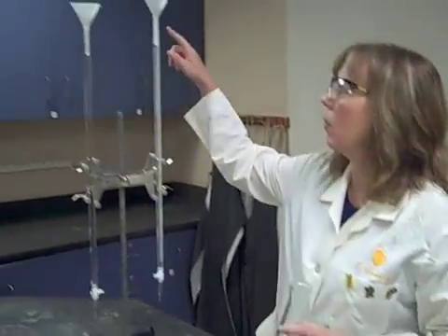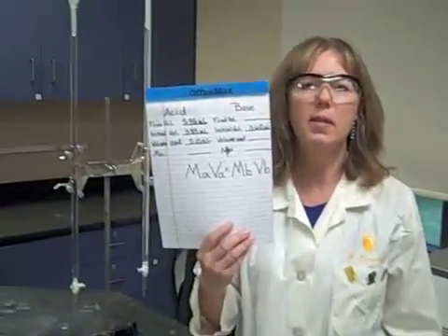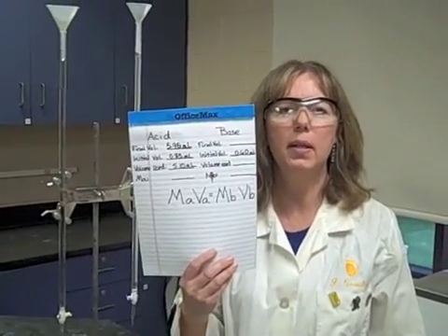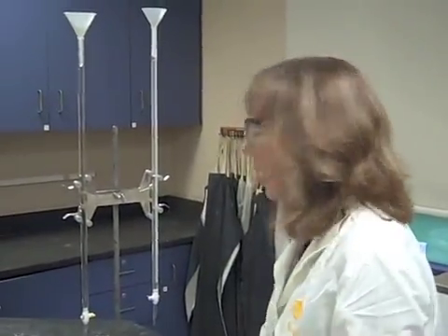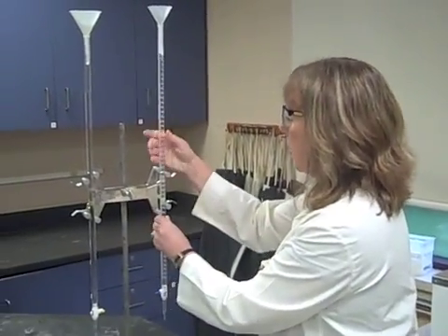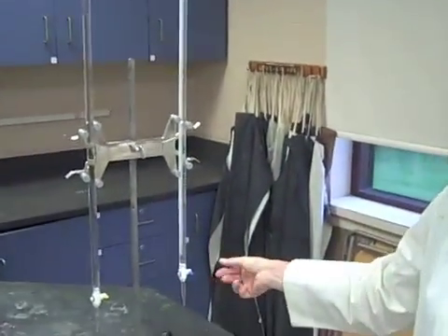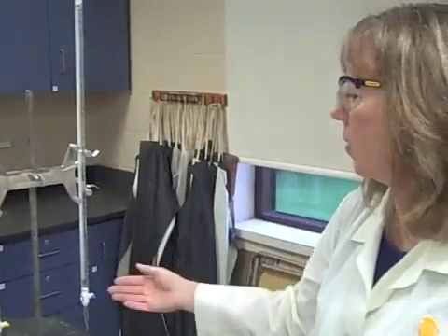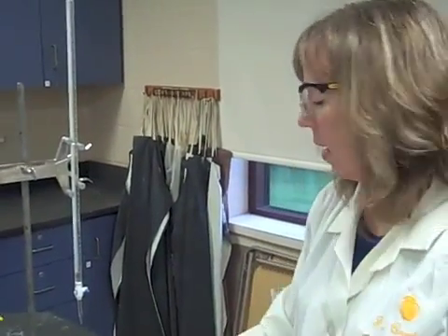Remember we recorded the base from part one of the video. We had 0.60 milliliters of the base to start with. Now, on this one, I'm going to go a little slower. I'm going to turn it this way because I'm right-handed and I want to manipulate the stopcock so that I can control the amount of base added.